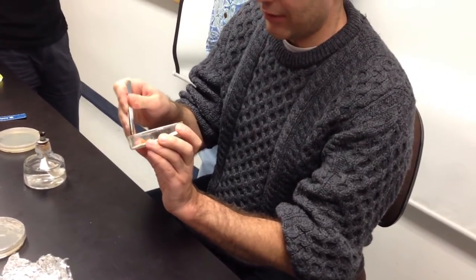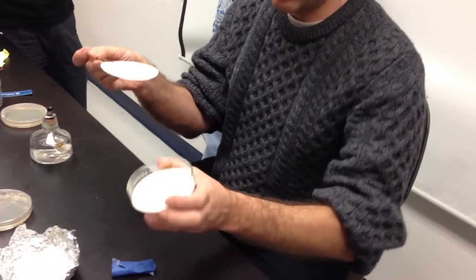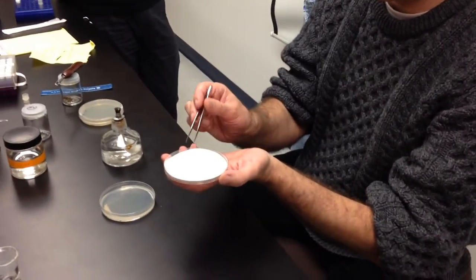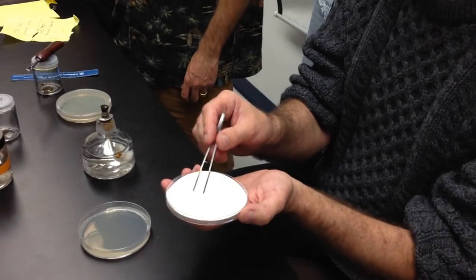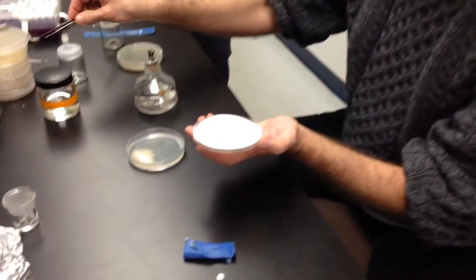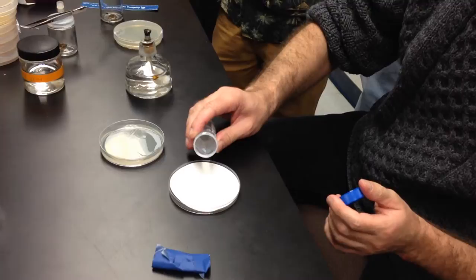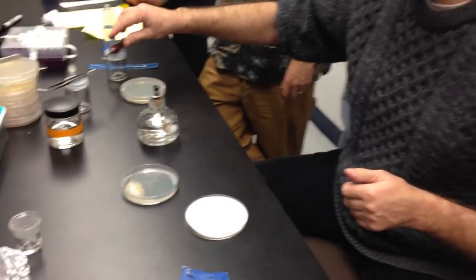It's a special way of making a plate. Just pour in the bottom and the lid. Is the lid completely filled with water? Yeah. What you want is to attach but also keep your filter paper moist, because if it's not moist — I usually use fresh plates — you can add a little bit of sterile water. So this is our nutrition agar and this is our water agar. Why use water agar? Because you want to avoid everything — there are not many organisms which will be happy on water agar, and even less which will be happy on sterile filter paper.